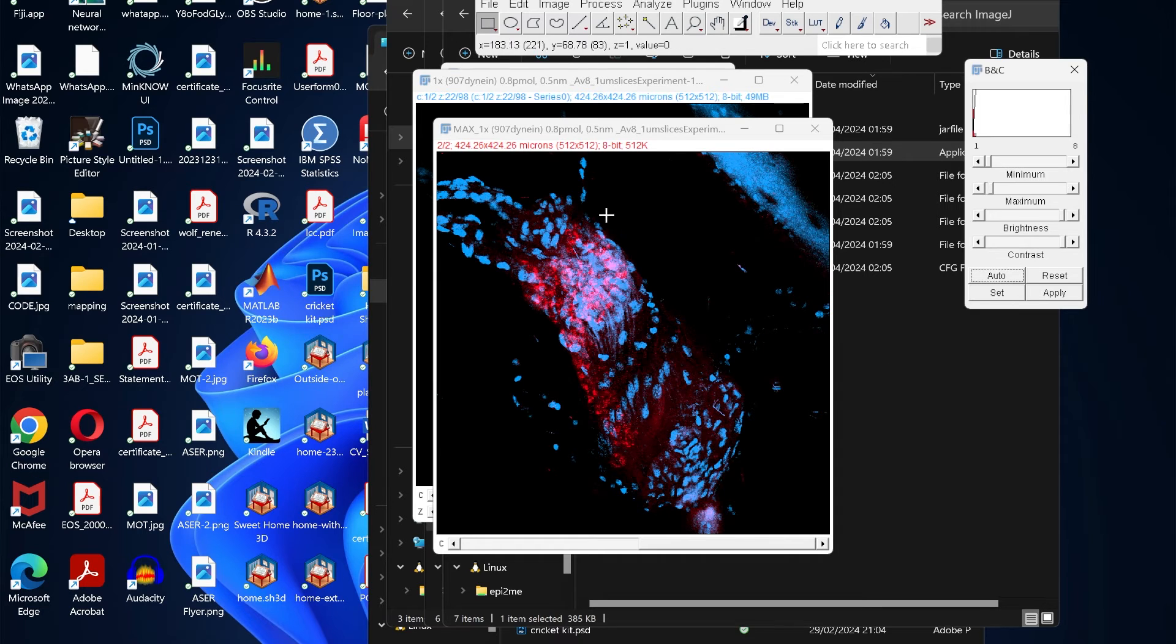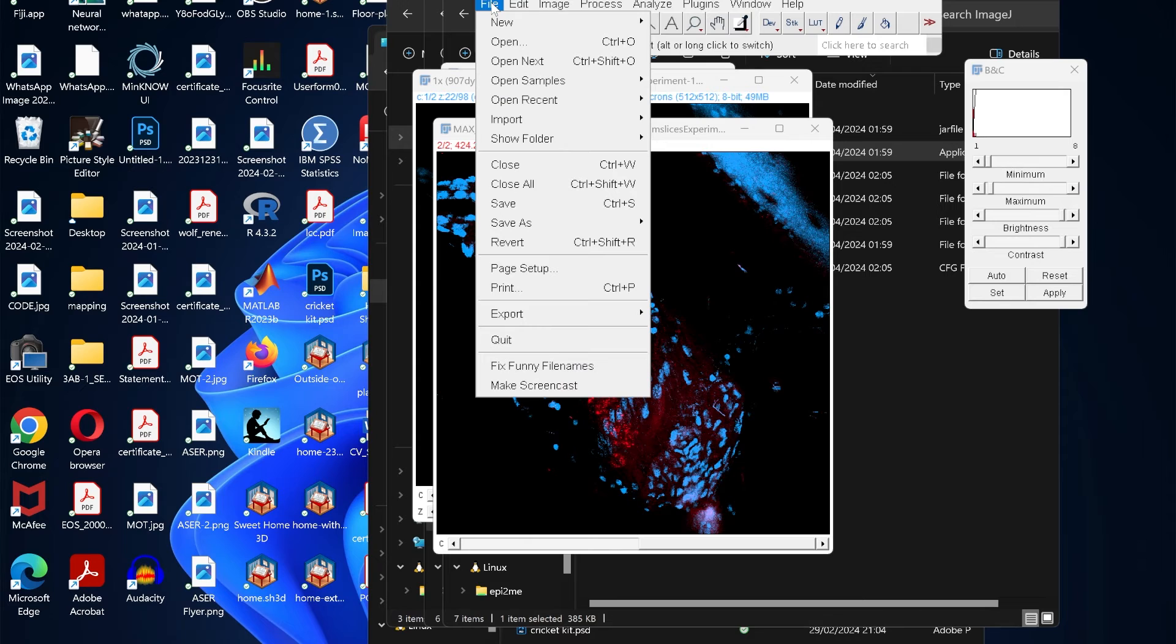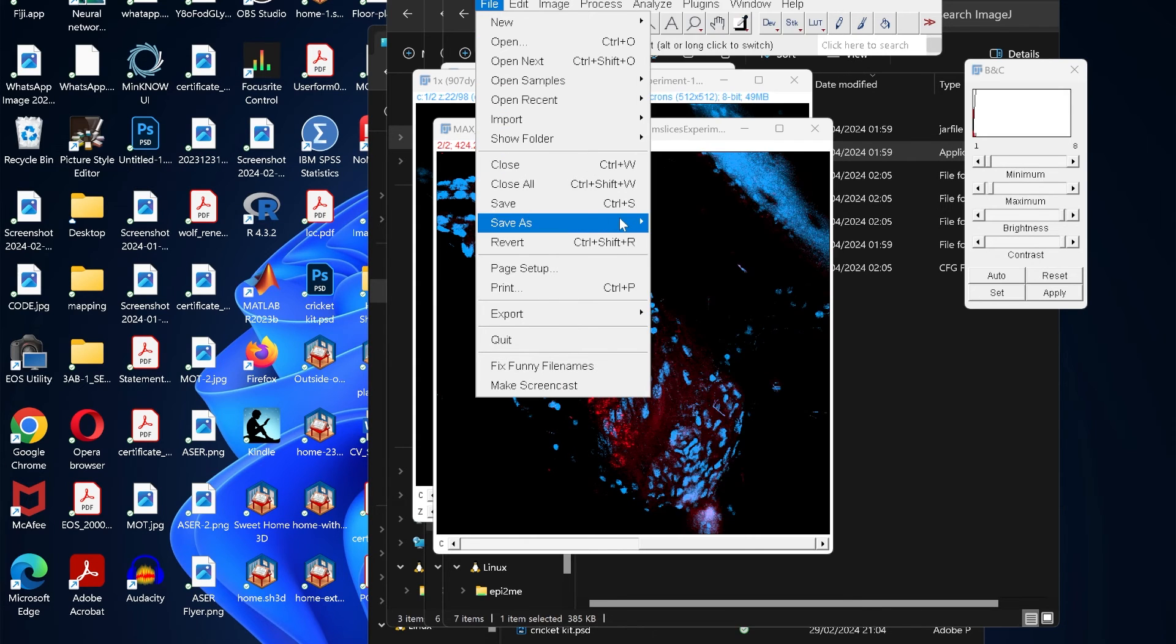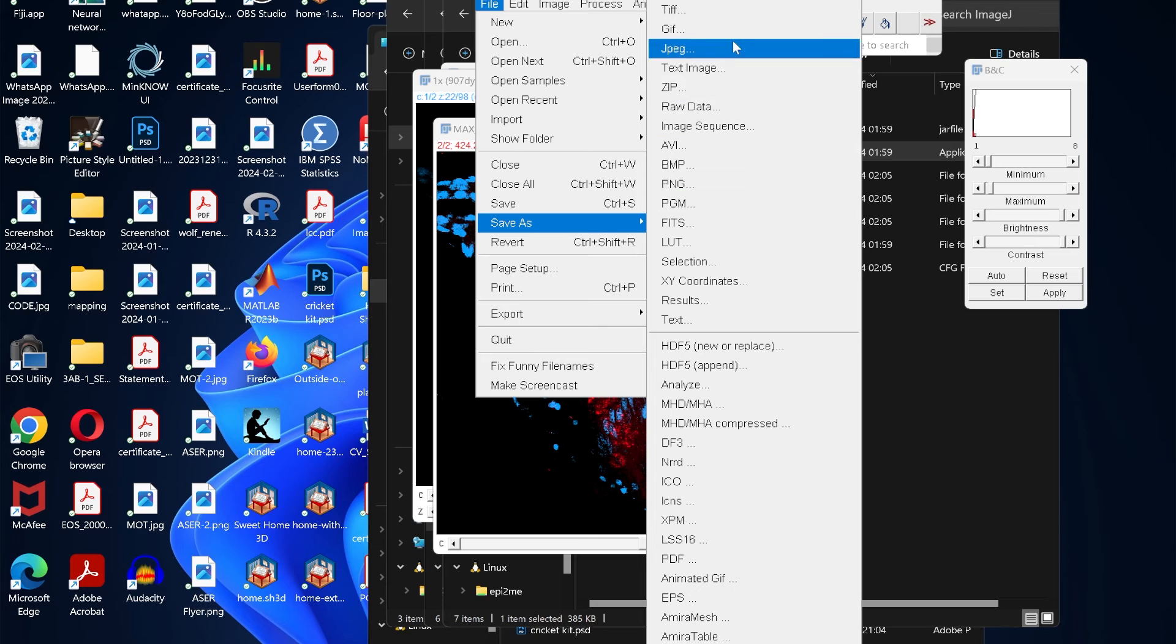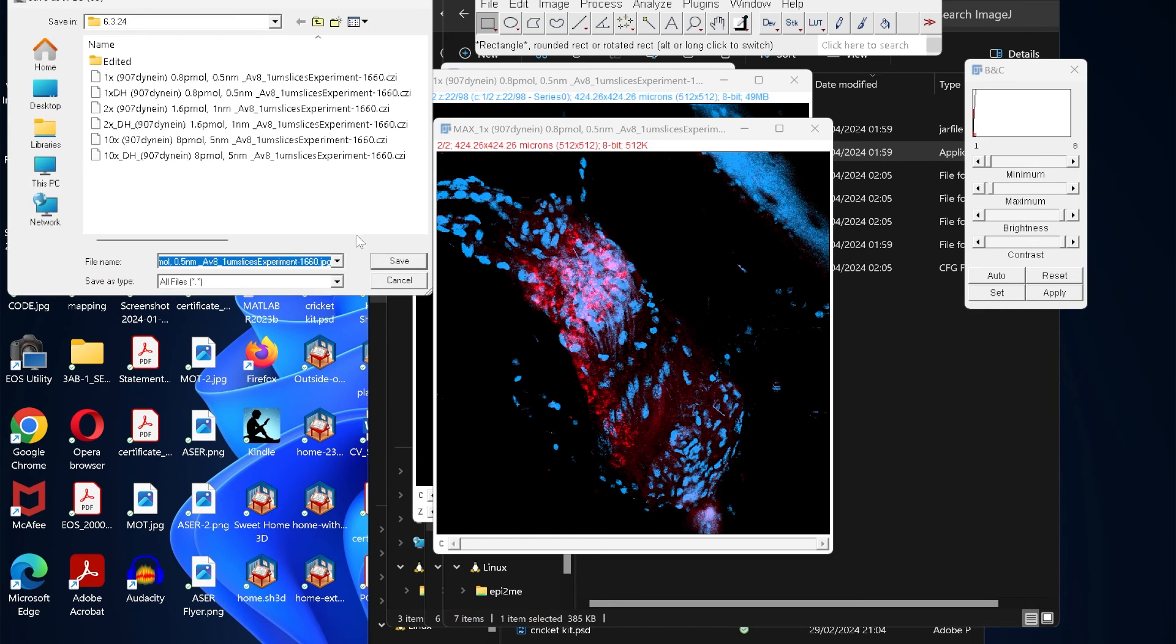Once you're happy with the adjustment, all you have to do is save the image. Click on File, then Save As, and you can choose the format you want, but it's easier to use the JPEG format. Choose the location and then you can save.